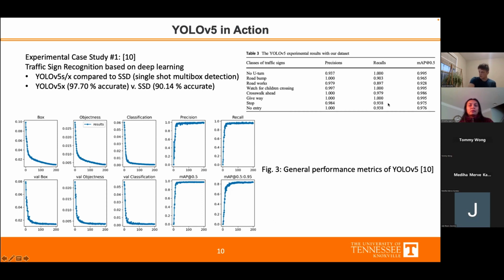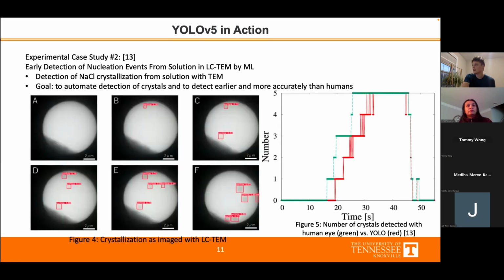This is used in tandem to compute your mAP value. And as can be clearly demonstrated, YOLO V5 dramatically outperformed the SSD algorithm, which is not much of a surprise given that YOLO V5 was developed for real-time image input, which is the type of thing you would have from driving around with a camera on top of your car.